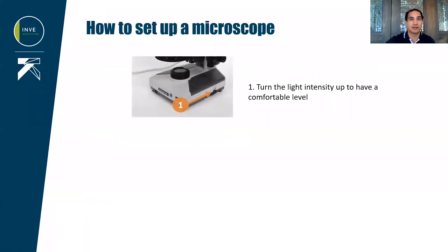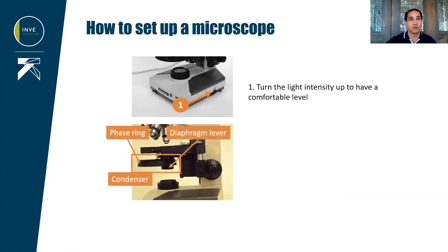We can now increase the light to a comfortable level. For the next steps, we will set up the condenser. Condensers are composed of a diaphragm that can be adjusted and, on some models of microscope, a phase ring.